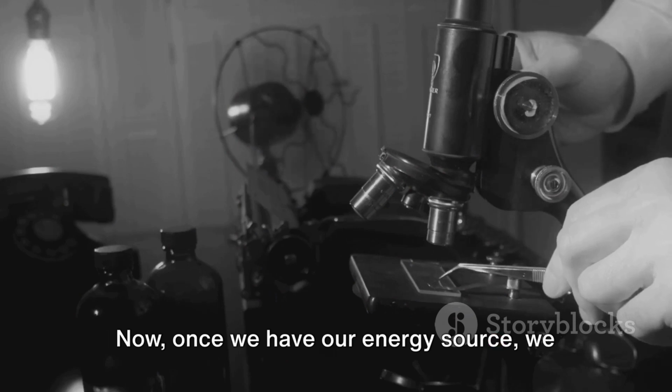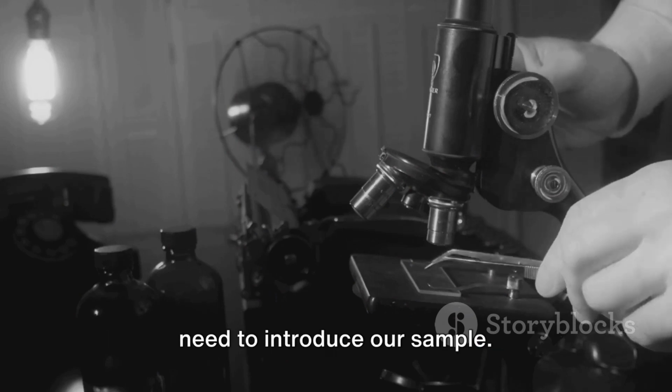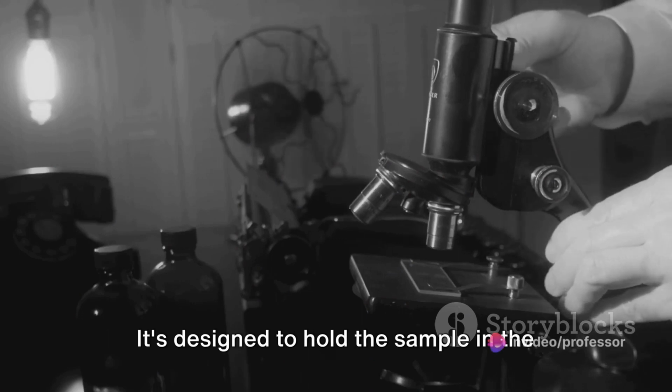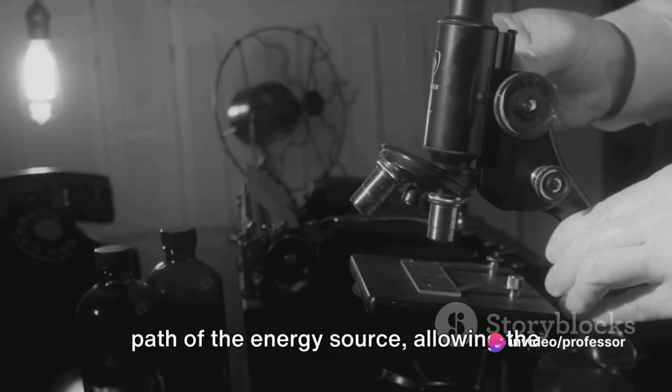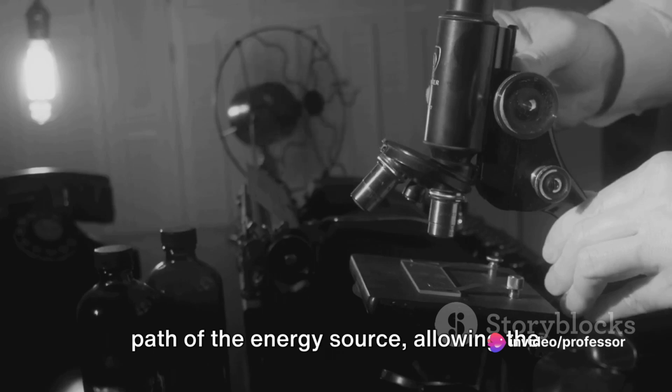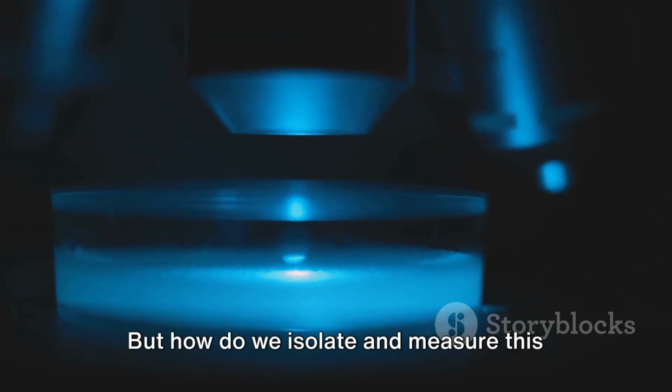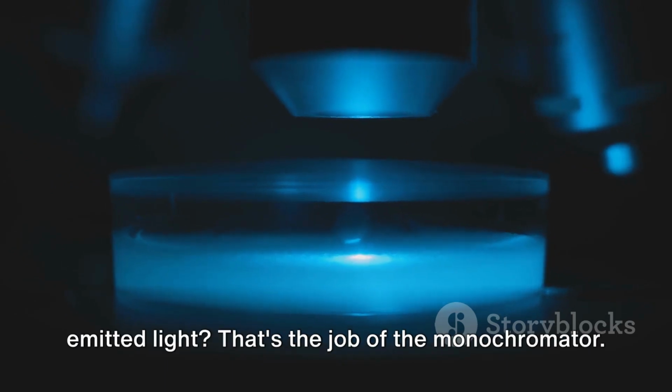Now, once we have our energy source, we need to introduce our sample. This is where the sample holder comes into play. It's designed to hold the sample in the path of the energy source, allowing the atoms to absorb its energy and subsequently emit light. But how do we isolate and measure this emitted light?